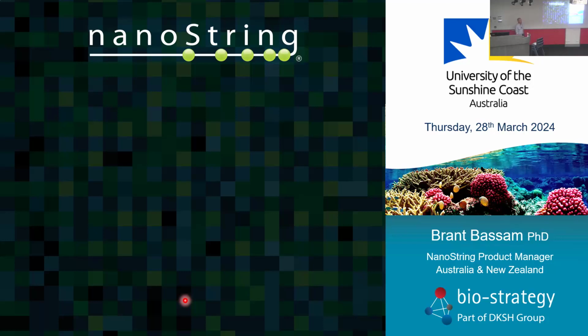Yeah, I guess my background got a bit of experience in it, and I reckon it's probably 2013. You said you kind of sold it to Australia, and I was hooked on it. Since then we've only really used it once. But I guess what people want to know is the process, numbers, costs. If you've only got 10 genes, do we use our digital PCR here or qPCR?